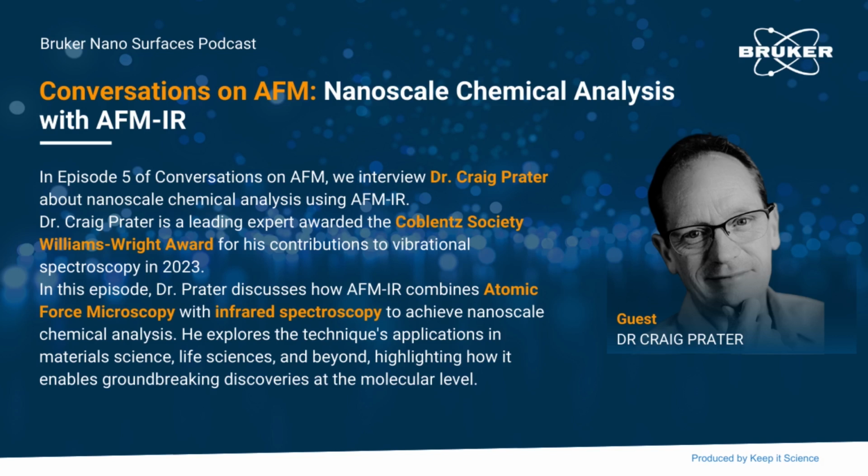And so now you spoke a lot about AFM-IR, which is absolutely great, but we also know that he obviously developed and absolutely spearheaded optical photothermal infrared technology, which takes all of this a whole step further. And maybe you can explain to our listeners what it is and what the benefit of that technology is.